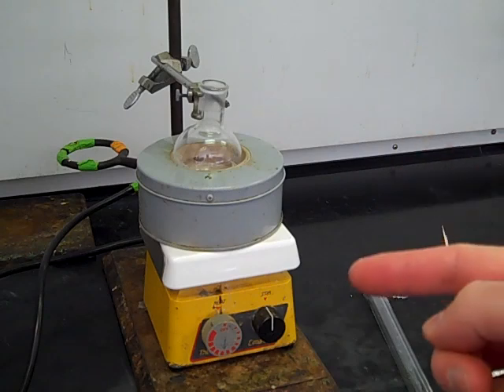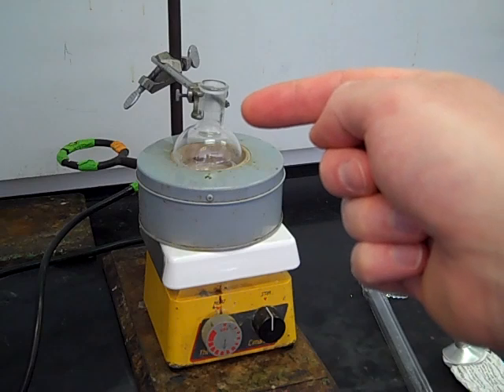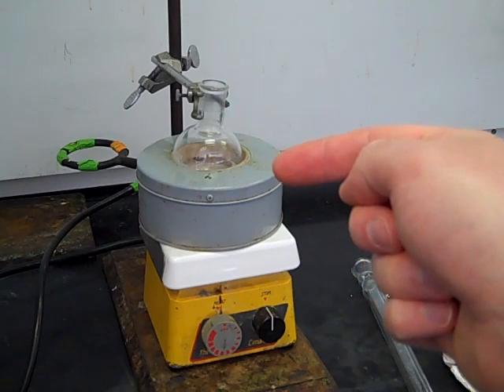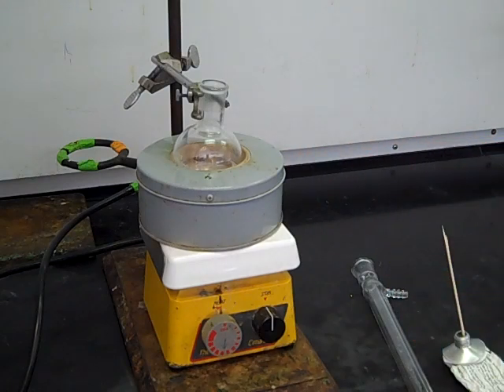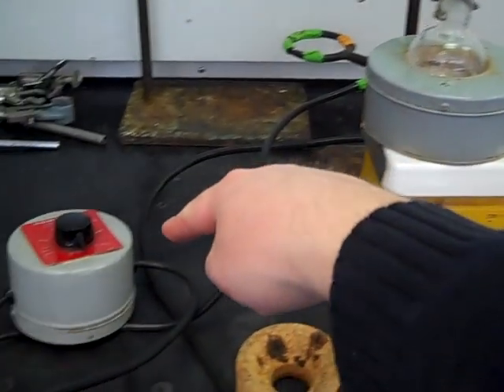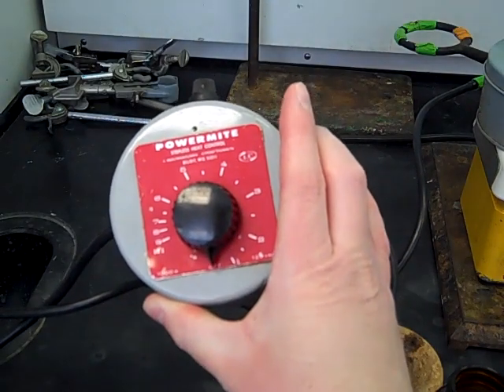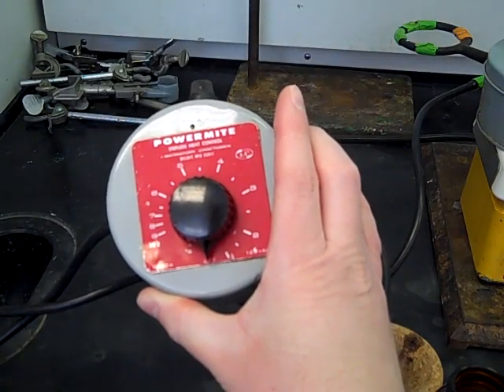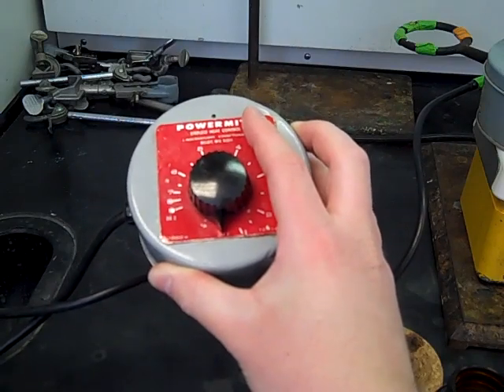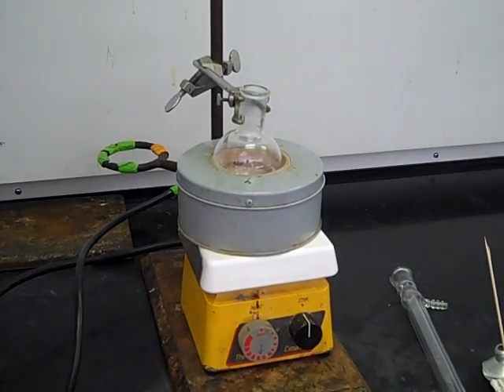Here's the start of our apparatus. We have the hot plate on the bottom, the heating mantle, and then our round bottom flask. I used the 100 mL, which fit perfectly into this heating mantle. If you had the 50 mL, you'd use the smaller heating mantle. This heating mantle plugs into the power mite, which has markers on it so you can tell how much power you're giving to the heat source. The power mite then plugs into the wall.